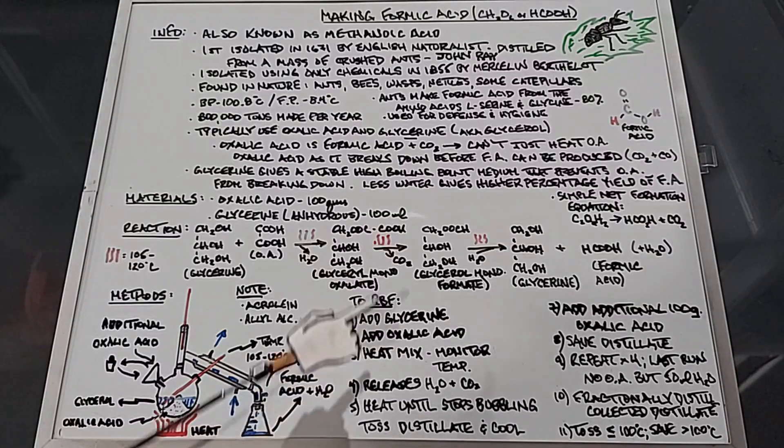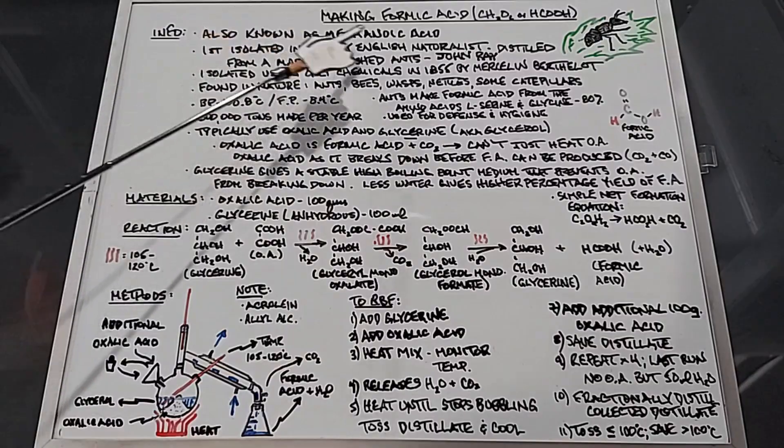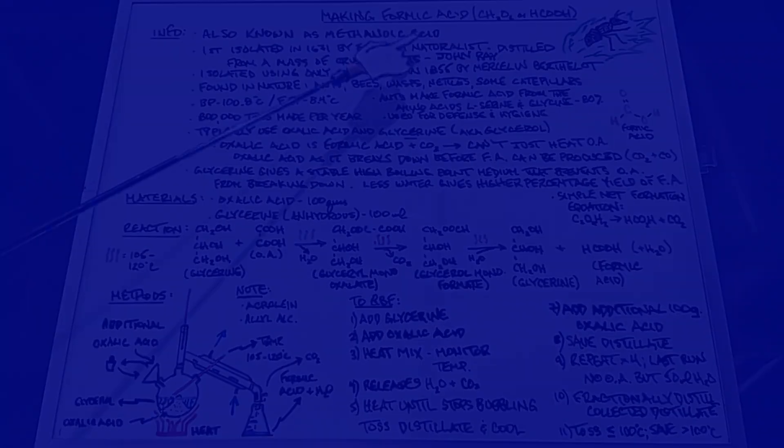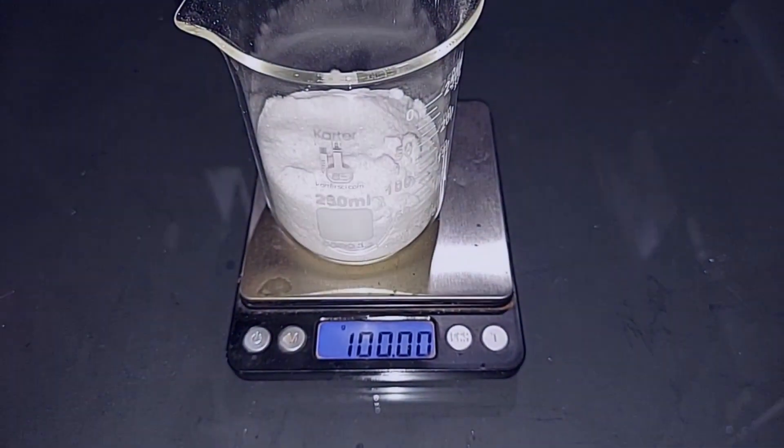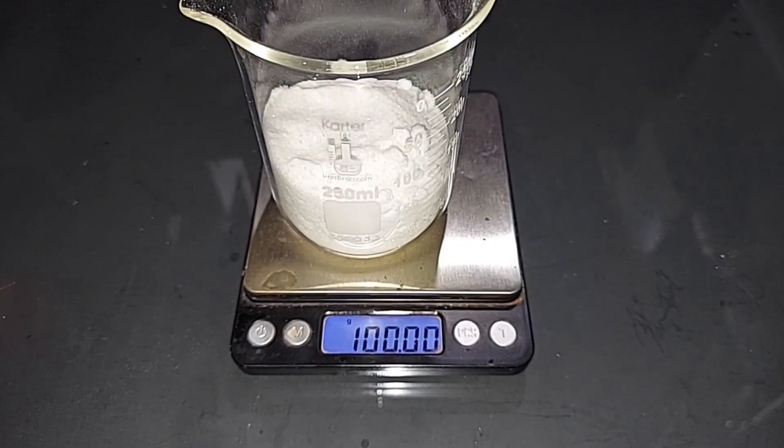The last step will be to switch to a fractional distillation setup. Since we're not getting pure formic acid — the boiling point of formic acid is 100.8 degrees — we won't be getting that right at 100 degrees. We'll toss everything that comes over at 100 degrees or below (mostly water). As soon as it jumps to 101 and above, I'll start collecting in a flask. If the temperature jumps again, I'll swap to another flask, collecting the highest percentage of formic acid separately so it doesn't mix with lower-percentage fractions.